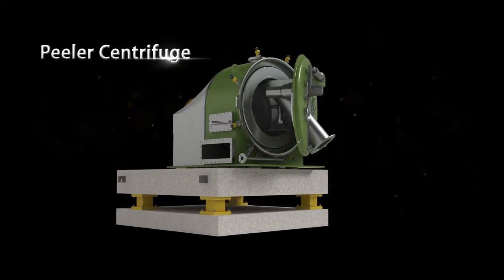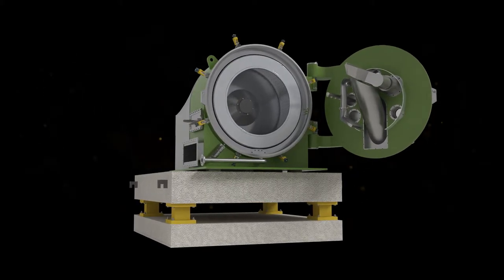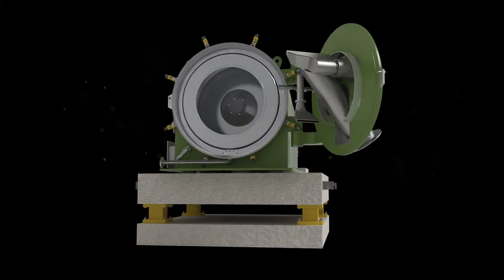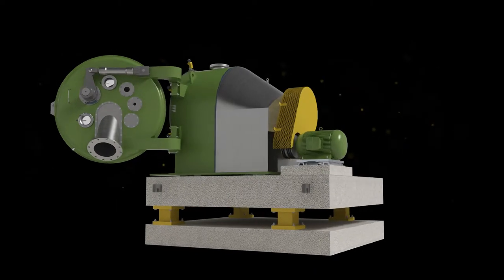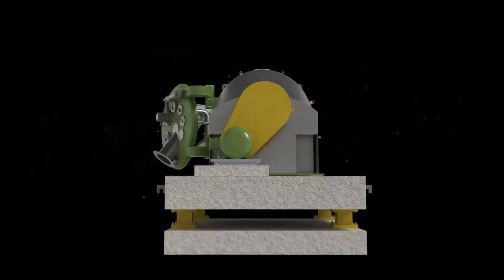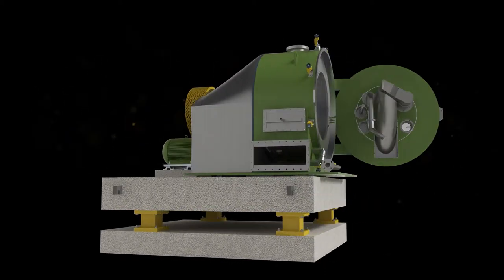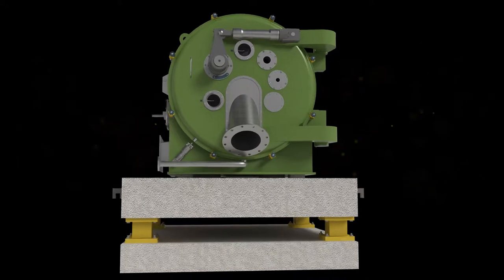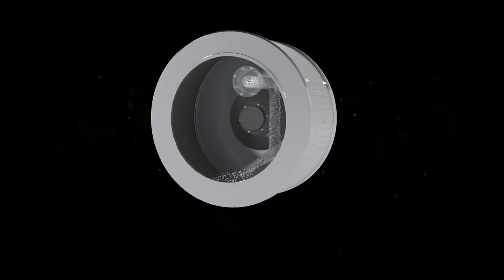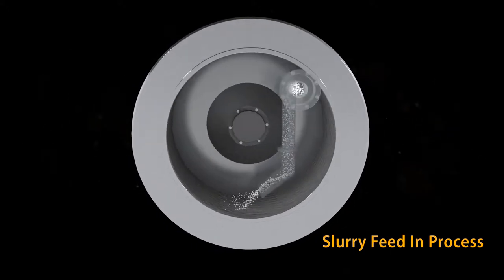Peeler centrifuge is semi-continuous equipment. Operations are feed, wash, filtration, and discharge. Feeding is done through the feed pipe and slurry is distributed uniformly in the basket.